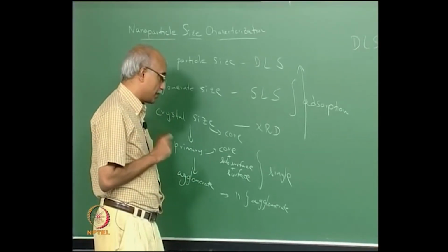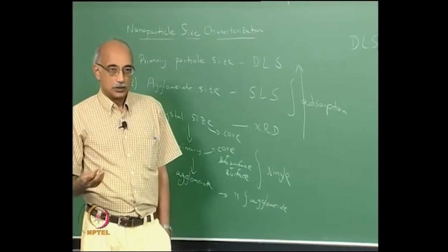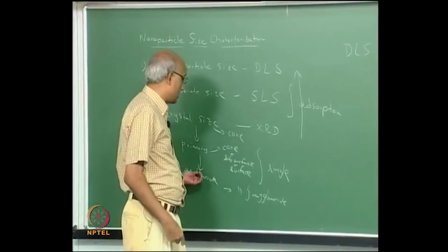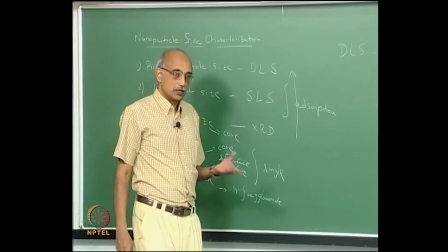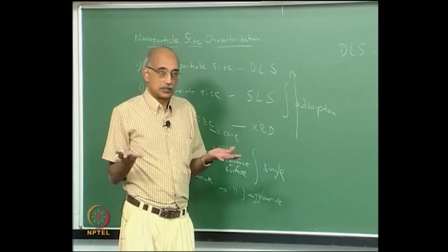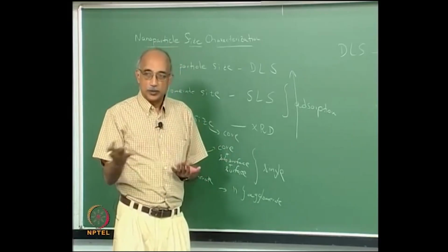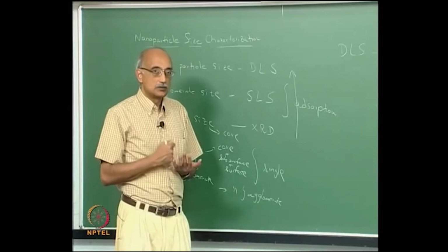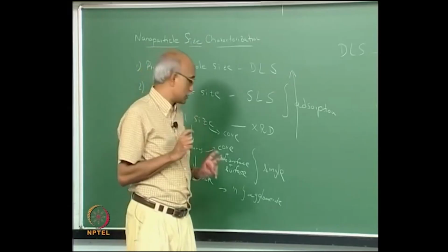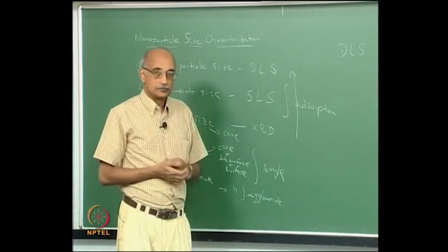If you are primarily interested in how particles in a suspension look when they are presented to the next stage in the process, then the agglomerate diameter is the one that's most relevant to you, because in reality that's how the particles exist. So, in terms of looking at storage, flowability, dissolution, chemical reactivity, all these product functional characteristics, the agglomerate diameter is the one that is most relevant.